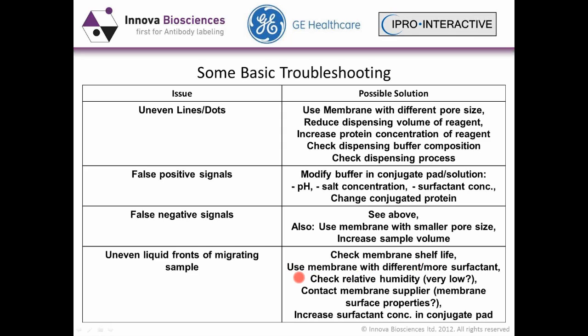Or do you run your test at extremely low relative humidities? Because this will always lead to hydrophobicity issues, and this leads to uneven liquid fronts.